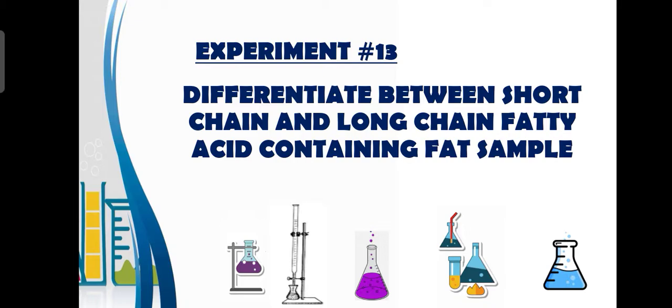As per our designated assignment, I'll today be talking about experiment number 13, that is differentiate between short chain and long chain fatty acid containing fat sample.